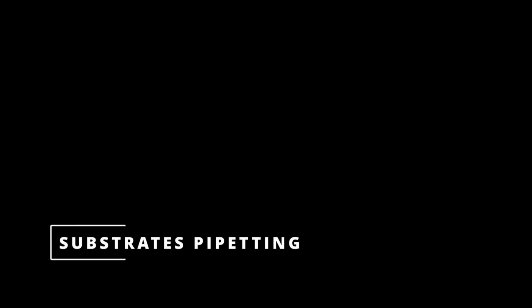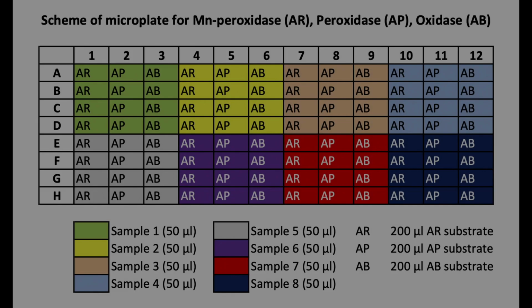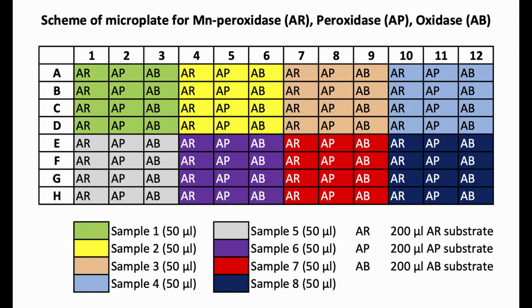Next step is to distribute the substrate solutions into the microplate. 200 microliters is pipetted into given wells.